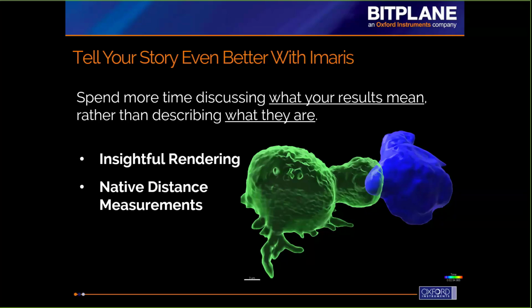It comes from within these creation wizards because they do take you through the process of identifying and segmenting objects in your image very nicely. Also, because these distance measurements are found within the creation wizards, that also means that it's large data capable as well as batchable, and I'll go over that in more detail in that second section as well.